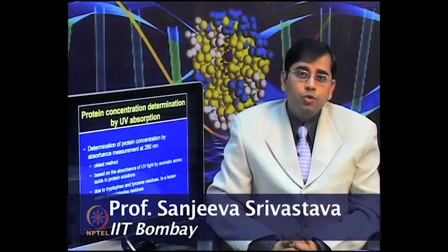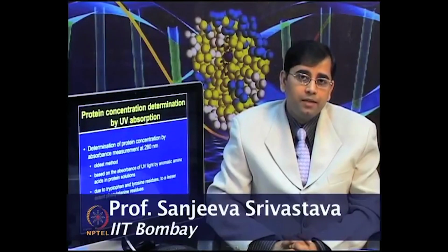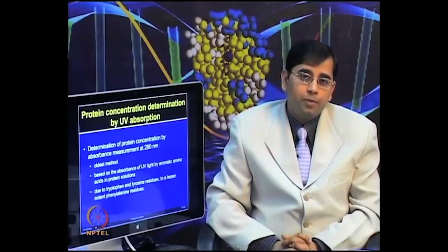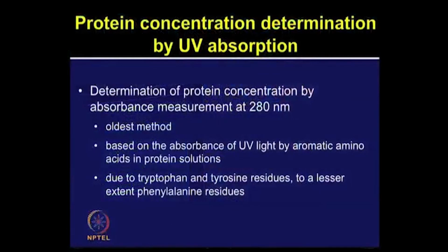Protein concentration determination by UV absorption is one of the very commonly used methods, in fact the oldest method used to determine protein concentration, by the absorbance at 280 nanometers. This method is based on the absorbance of ultraviolet light by aromatic amino acids such as tryptophan and tyrosine residues, which are present in protein solutions.